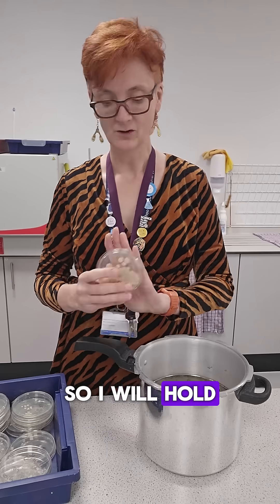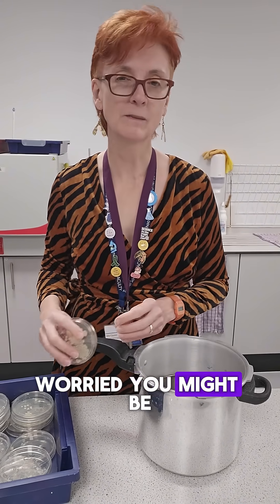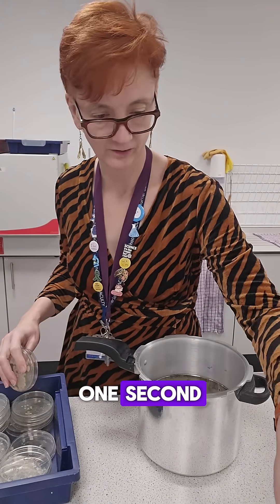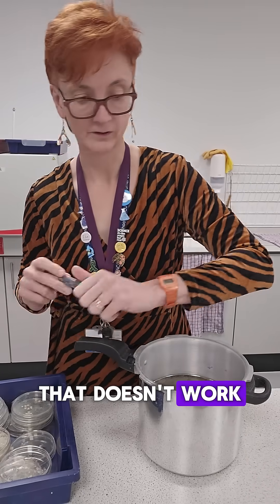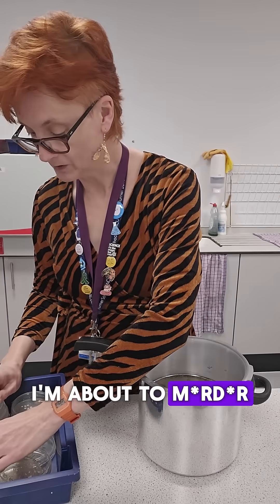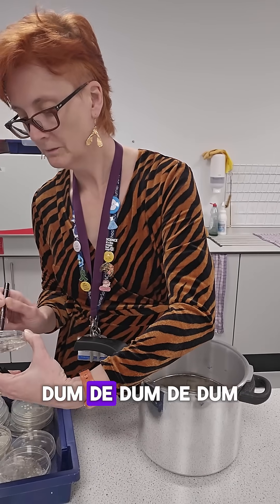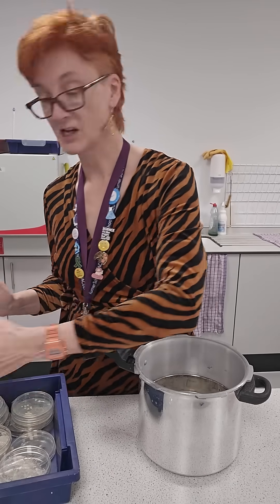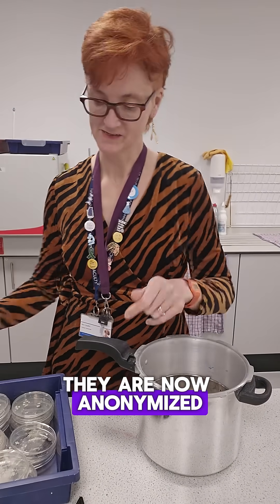I will hold them like this so you can't see the names. I'm worried you might be able to see the names, so I will quickly do something about that. That doesn't work — I will just deface them. I'm about to murder them all, so it's alright. Names have been changed to protect the innocent. God, they look so disgusting. They are now anonymised.